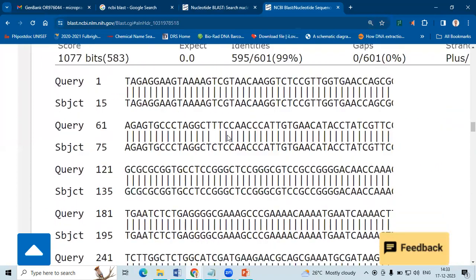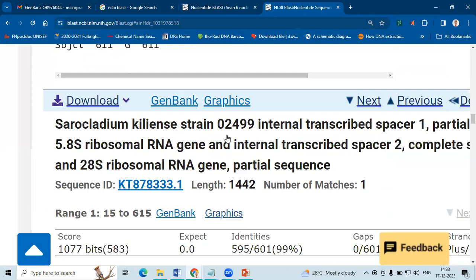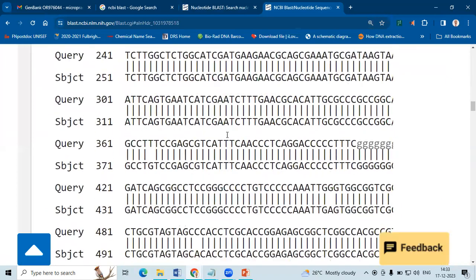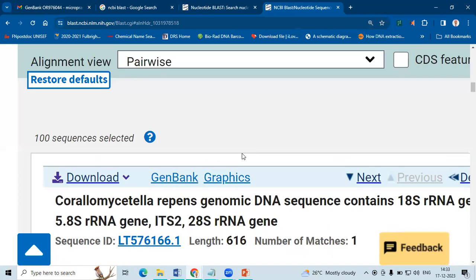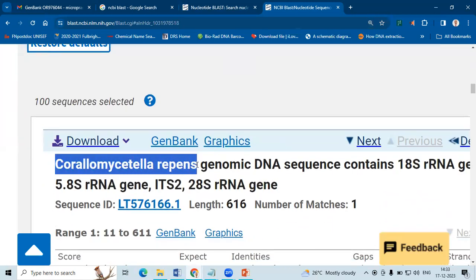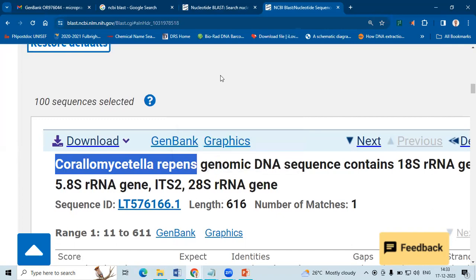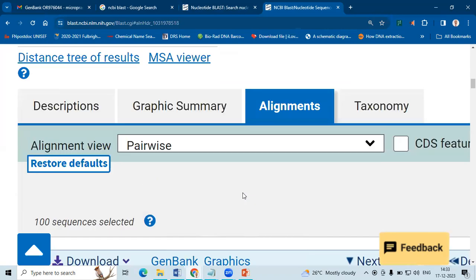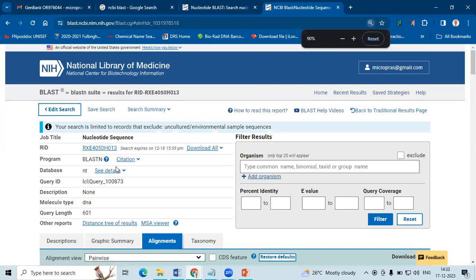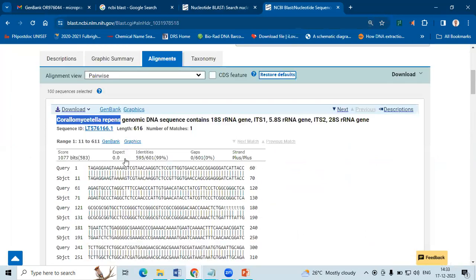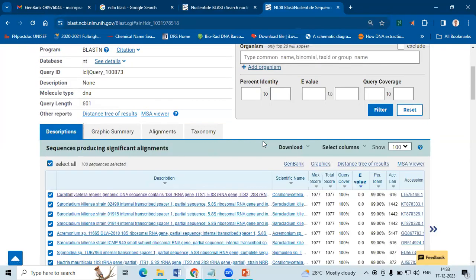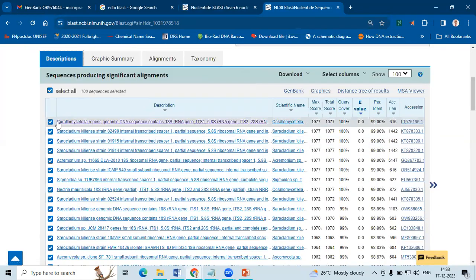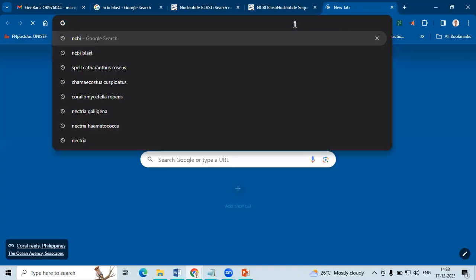So likewise, the other sequences will also follow. So I guess this Corallomycetella repens is only one sequence available in the subject database. I think one or two should be available. That is why only one sheet has been formed. Shall we confirm how many sequences available?